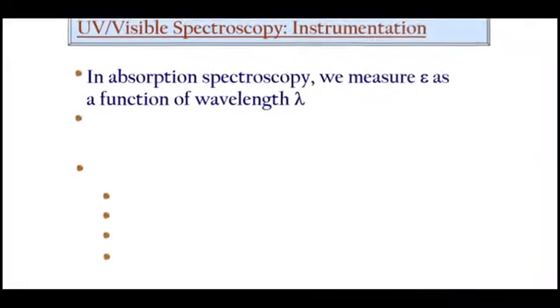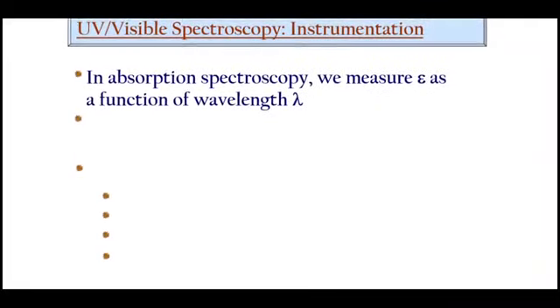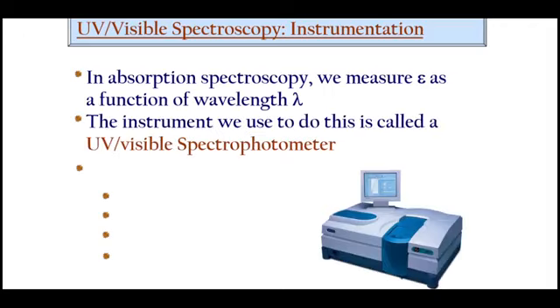The commercial optical spectrometer enables such experiments to be conducted with ease and surveys both the near ultraviolet and visible portion of the spectrum.